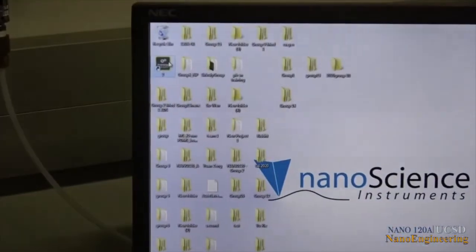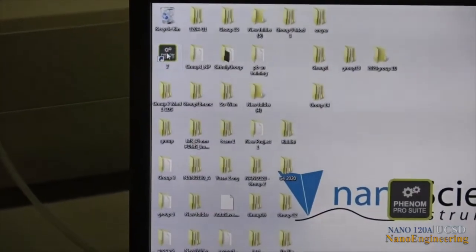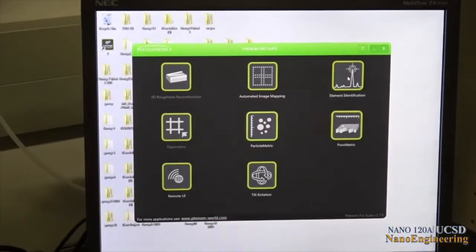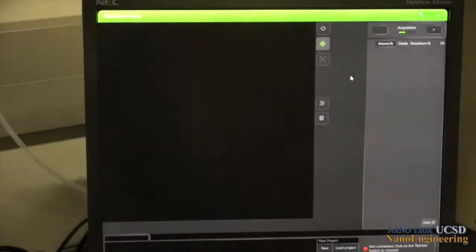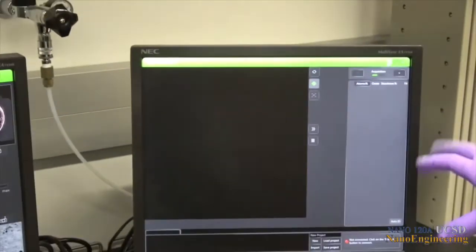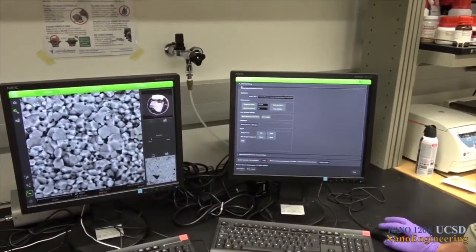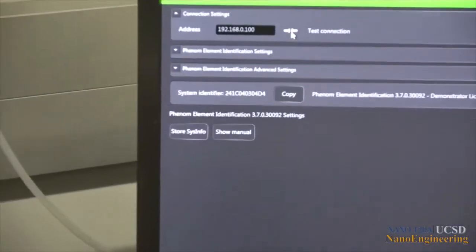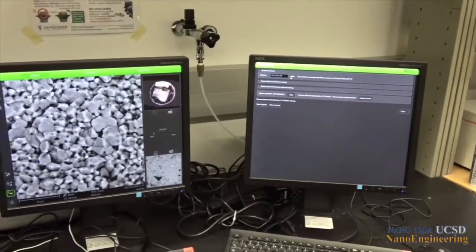Once the image is adjusted satisfactorily, we click on the icon entitled Phenom Pro Suite on the right hand side computer screen and choose Elemental Identification in the upper right. To allow communication between the two screens, we have to click on the settings wheel icon in the upper right of the right hand screen and click on Connection Settings to open the Connections menu. Clicking on the Connect symbol in this menu shows the connection status with the label successfully connected to Phenom.